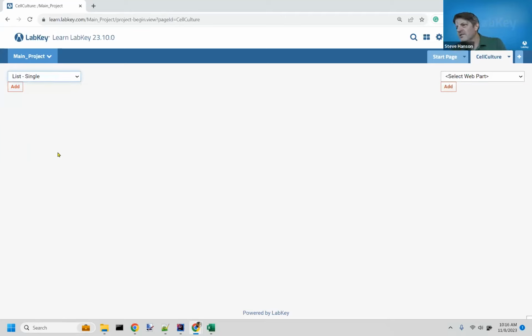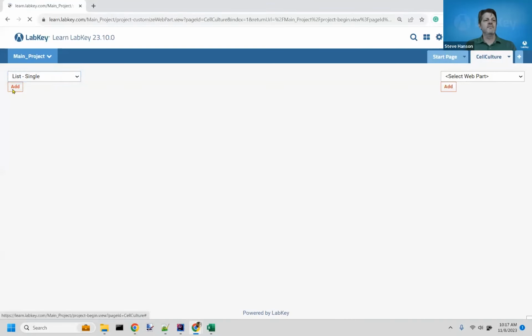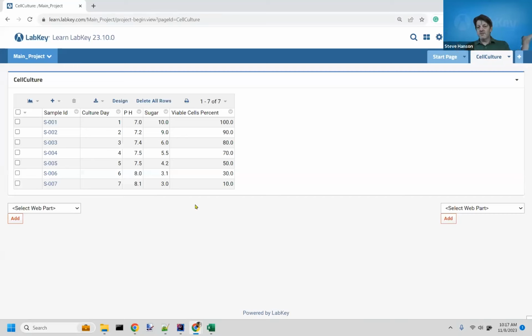And did I answer that question? There was a question here about Excel formatting issues. Yeah, Excel has a lot of formatting issues. How are these handled during the upload to LabKey, such as date formats, etc.? Let me go back a little bit and look at that. Well, first of all, let's add this list to our tab. Let's add the cell culture list. So here it is. We've imported a list and we've surfaced it on a tab.